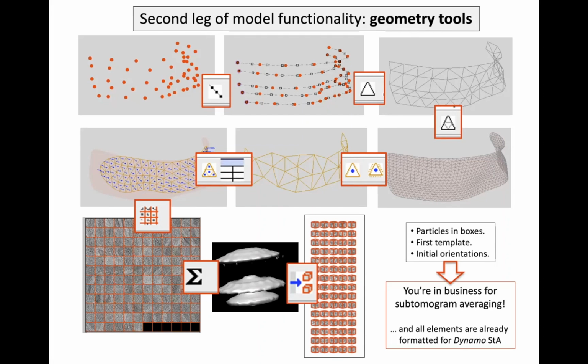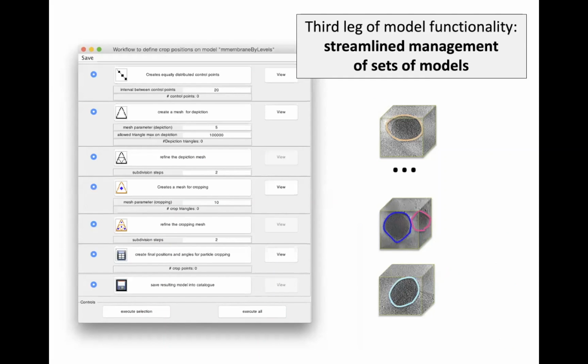Obviously, if you want to really go to each small membrane in your data set and play with the parameters, asking is this surface good, do we have artifacts, that can take a long time.